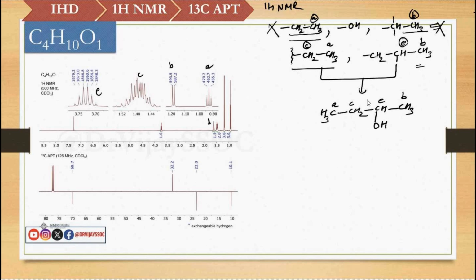but we can use this carbon NMR to verify this structure. So let's look at the carbon NMR. There is one downward signal around 70 ppm. We know that a downward signal belongs to CH3 or CH. This is in the deshielded region, so this is probably CH, and it is close to 70, so it is most probably connected to the hydroxy group. And you can say that this kind of functional group is present in the molecule.